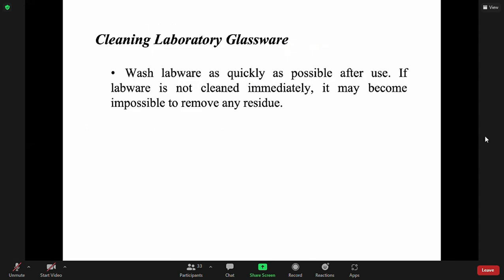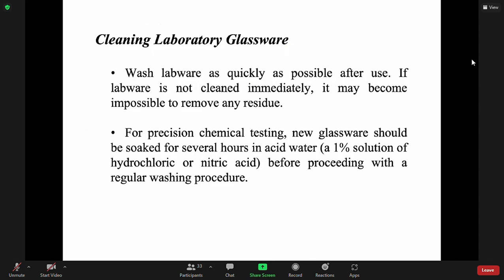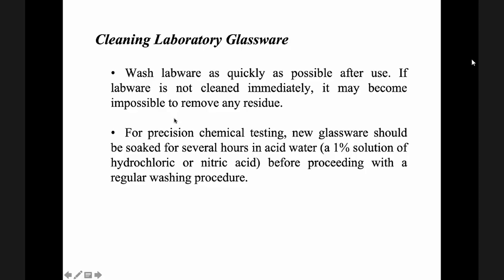So these are tips for cleaning. You just read na lang, ang highlights na lang. For precision chemical testing, new glasswares, this is usually the common error. Okay, di ba, ang notion is, bago mo na siyang glassware from the supplier, tinlo na siya. No, that's not the case. For precision chemical testing, new glassware should be soaked for several hours in acid. Ang bago or unused glassware, dapat i-soak siya for several hours in acid containing either hydrochloric or nitric acid before proceeding with the regular washing procedure.